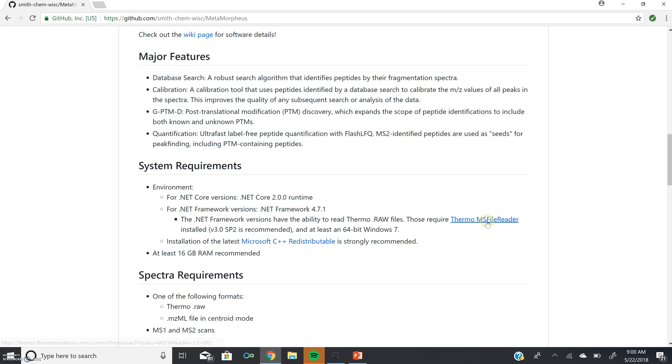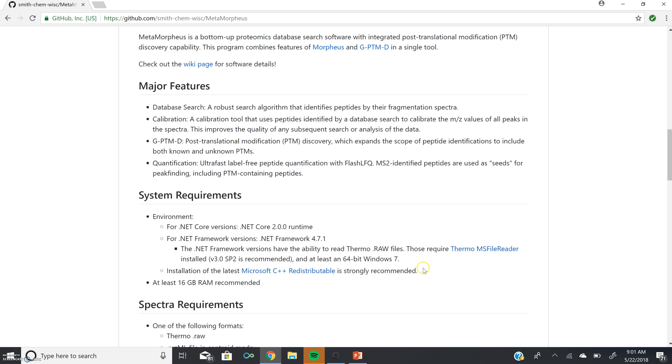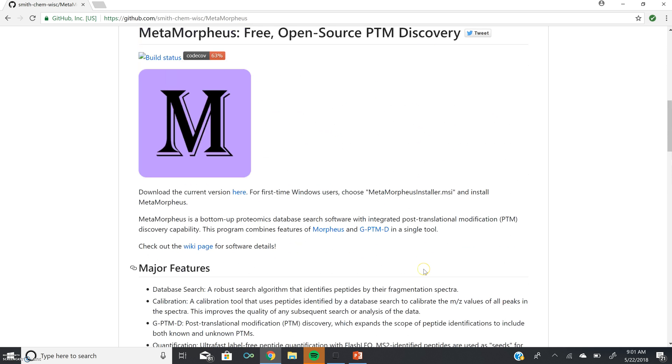If you're downloading the Thermo MS File Reader, you will need to make an account. Once at our GitHub page, you can also download Metamorpheus.